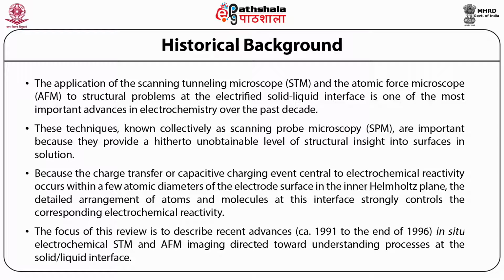The solid-liquid interface will always result in one kind of charge at the electrode and the opposite charge in the medium. That enables the capacitor which is formed to hold some charge, or the reverse of this, as we call it, the impedance, which changes once we change the parameters.